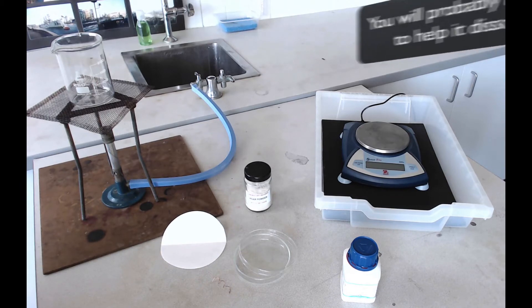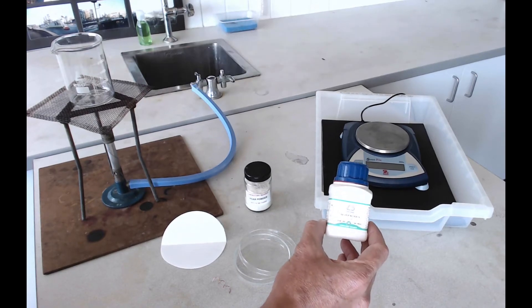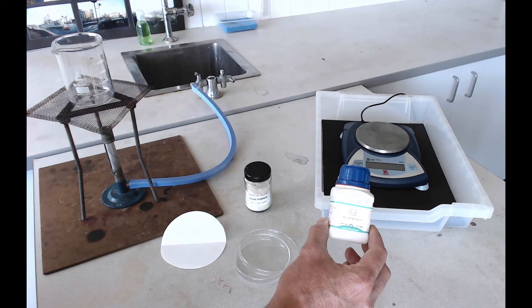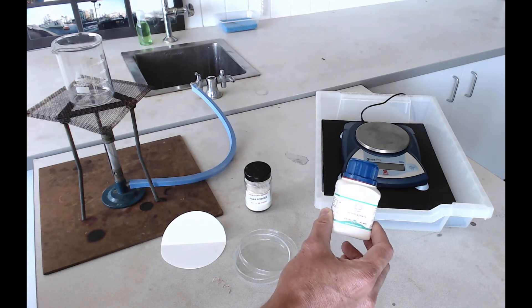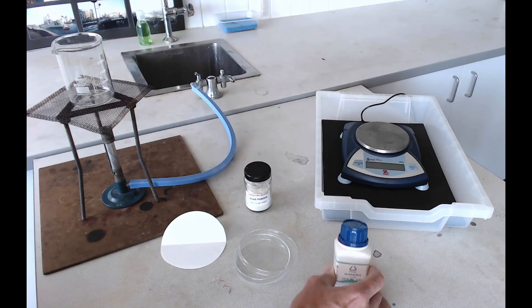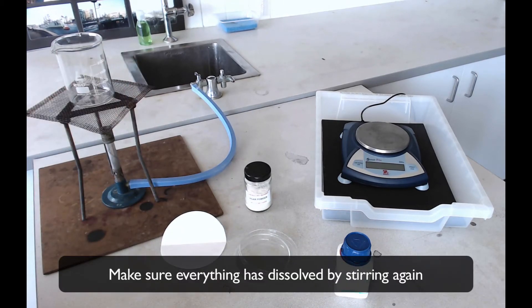Once you've got your agar to dissolve, you can add your silver nitrate to it. You need 0.3 grams of this, and it will probably be pre-weighed for you because it's quite easy to stain things if you spill it accidentally. Take your pre-weighed sample and add it to your solution of agar in the beaker.